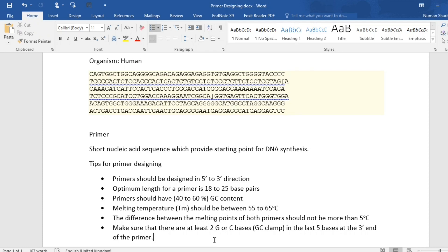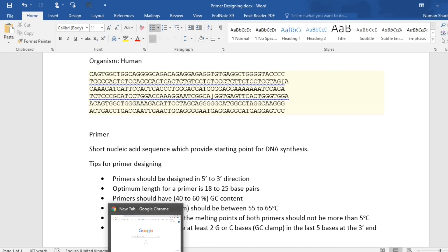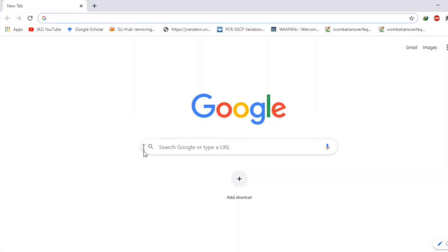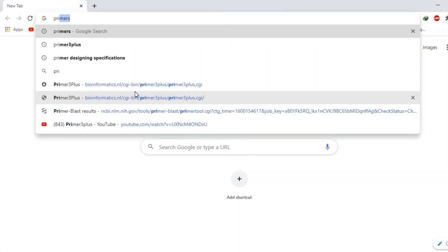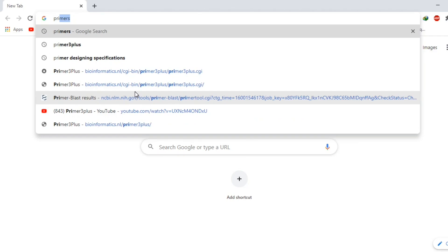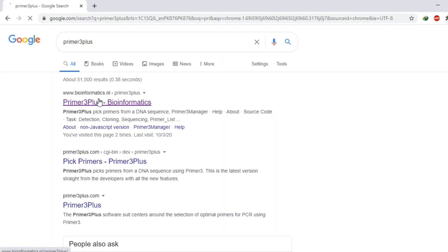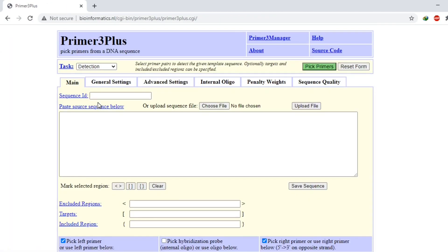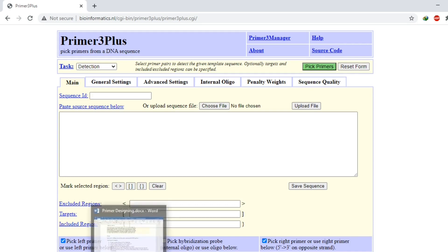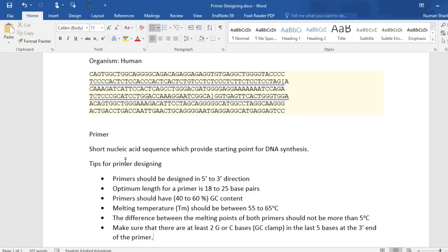So let's start primer designing. Open your browser and search Primer3Plus. Click on this first link, which is Primer3Plus. As I have the sequence for the gene, I will copy the sequence and paste it here.